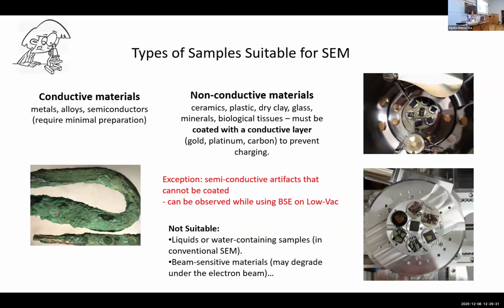To get the best pictures is sometimes really hard and time-consuming, and that applies to ceramics, plastic, dry clay, glass, minerals, and biological tissues. Usually they must be coated with conductive layers like gold, platinum, or carbon to prevent charging, because charging will cause our image to be really bad.